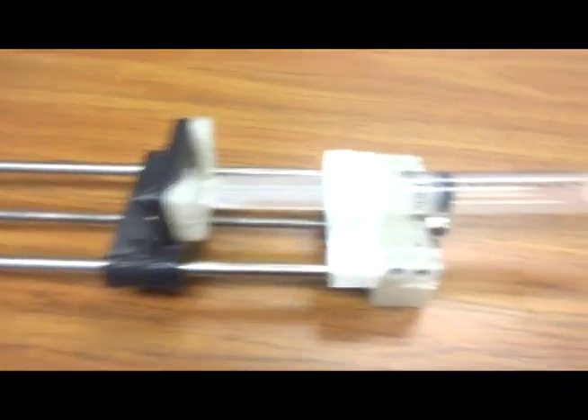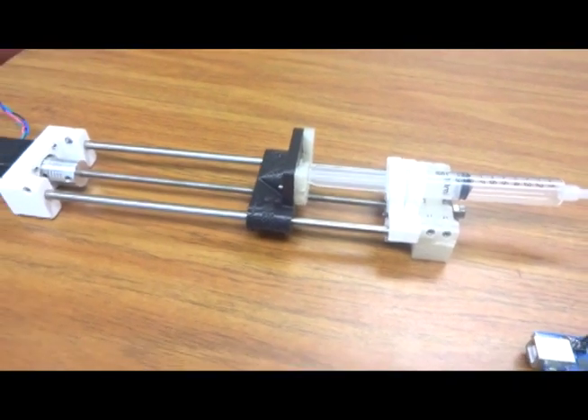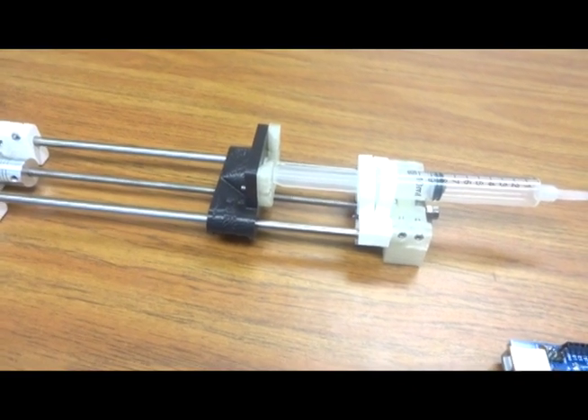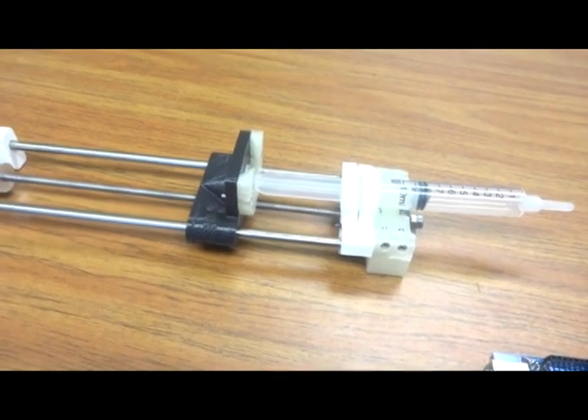You can get more and more complicated and go after more and more expensive equipment. This is an open source syringe pump — basically a linear actuator that we attach to a Raspberry Pi. Syringe pumps go for thousands of dollars, and you can get one that does anything you want, from electrospinning to blood transfusions or even use it for 3D printing itself.